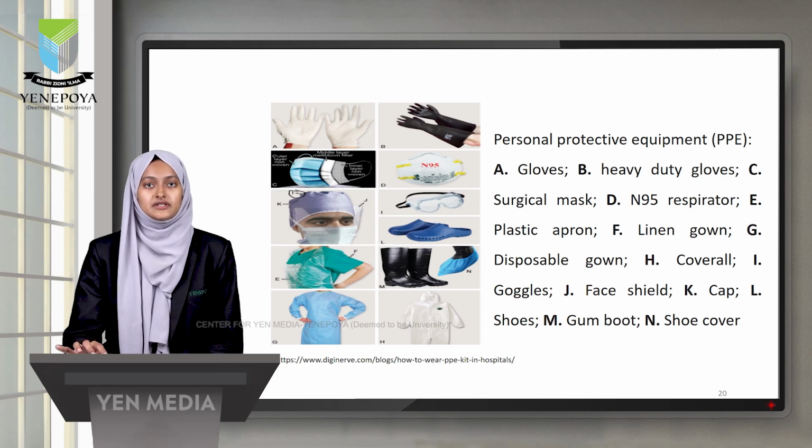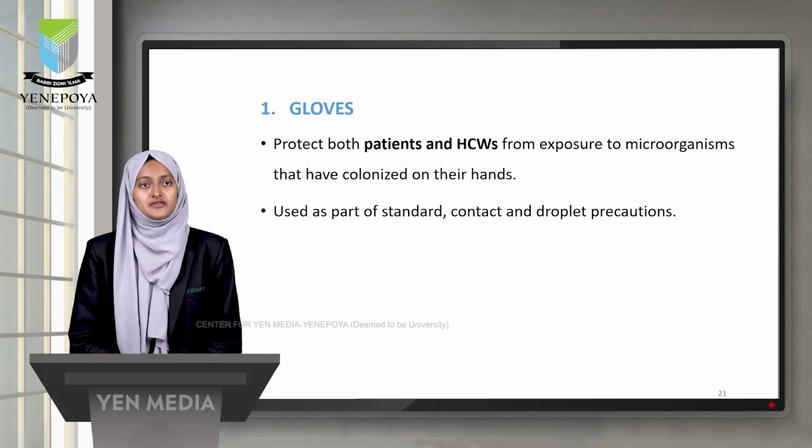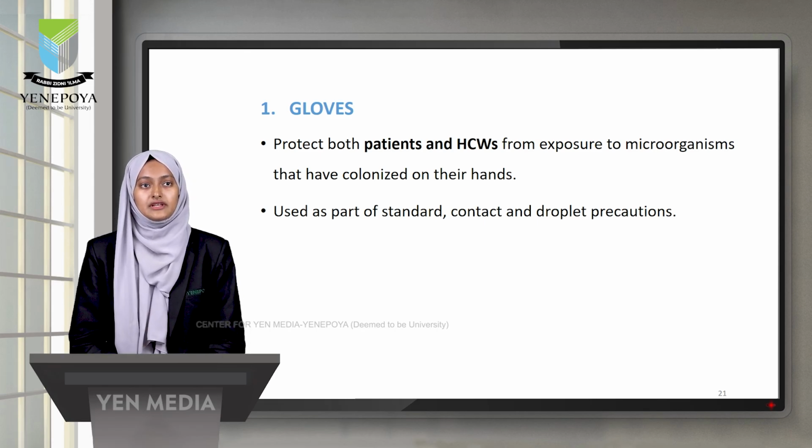So all these come under the personal protective equipment. Moving to the first one, that is the gloves. These gloves will protect both the patient as well as the healthcare worker from exposure to microorganisms.